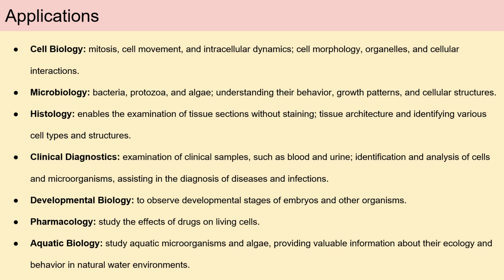Additionally, in developmental biology, phase contrast microscopy helps researchers observe developmental stages of embryos and other organisms, offering insights into morphogenetic changes. In pharmacology, it is used to assess the effects of drugs on living cells, allowing for real-time observations of cellular responses and drug mechanisms.